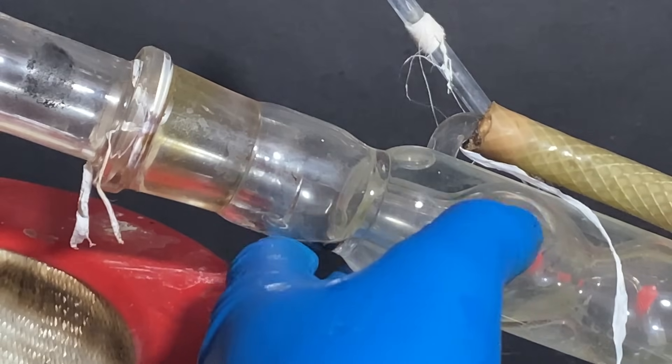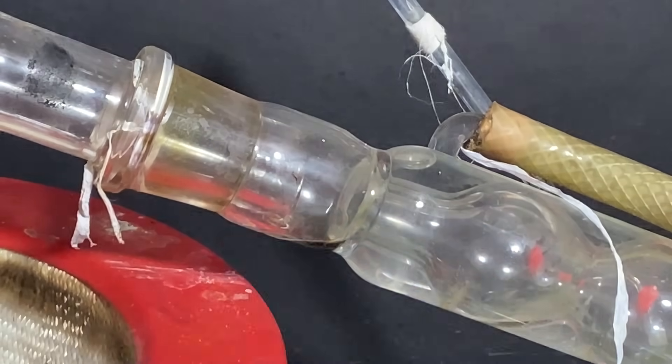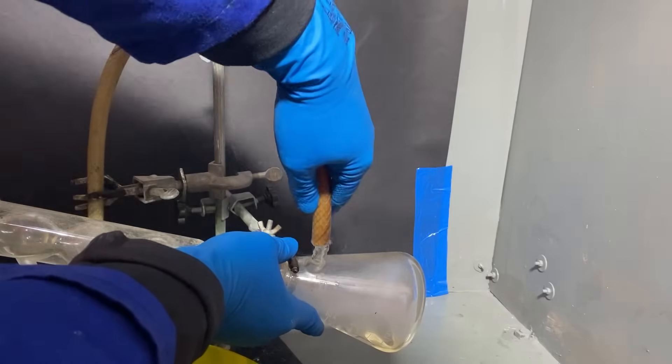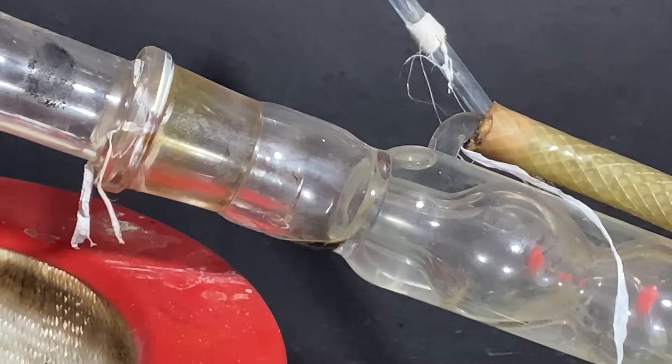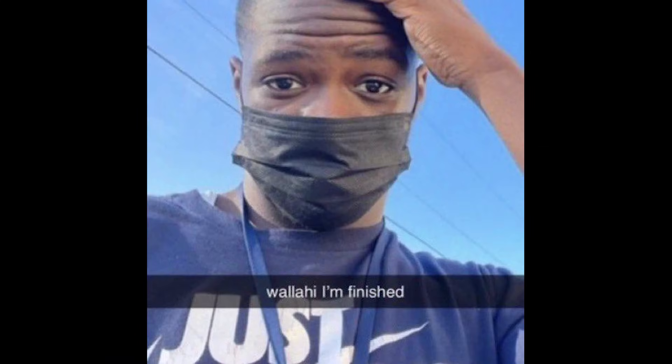Now, here I've done a little trick, which is before starting this procedure, I filled the condenser bulbs with some sulfuric acid. And this immediately dissolves the sulfur trioxide to form the desired oleum. I haven't really seen anybody do this on the internet, which is weird, because it's an extremely effective way of making oleum without endangering your life. So, I guess after all the talk that I did like 2 minutes ago, I truly am a pussy in the end.